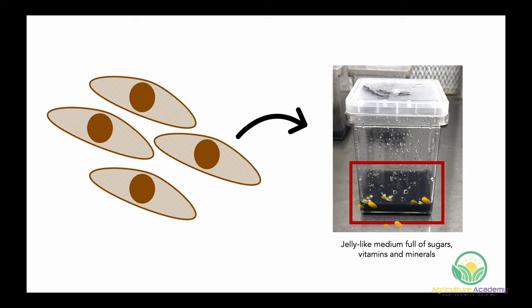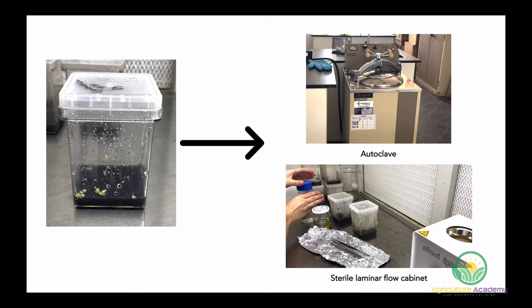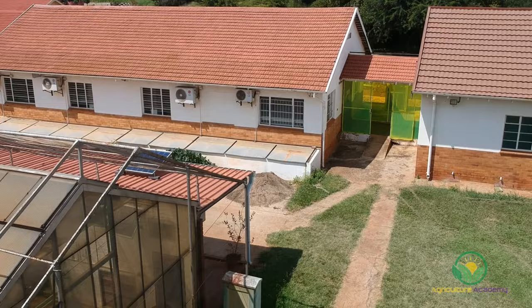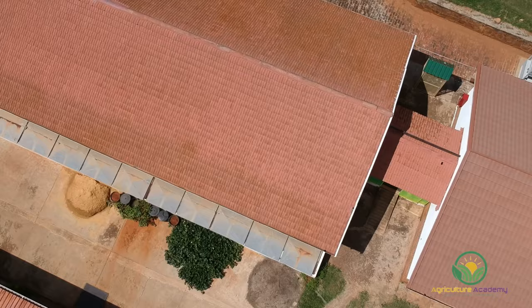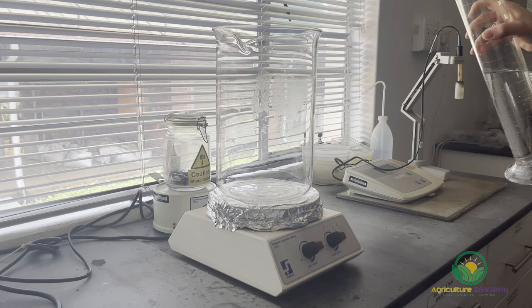Unfortunately, this environment is also loved by unwanted bacteria and fungi. This means the grower needs to work as sterile as possible when sowing their seeds. To do this, media needs to be autoclaved and a sterile room helps eliminate airborne pathogens. We were lucky enough to make use of a professional tissue culture laboratory equipped with autoclaves and laminar flow cabinets. But we will try offer at home alternatives for all the hobbyists out there.